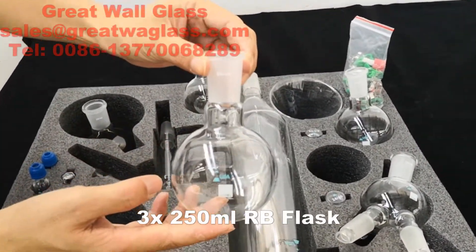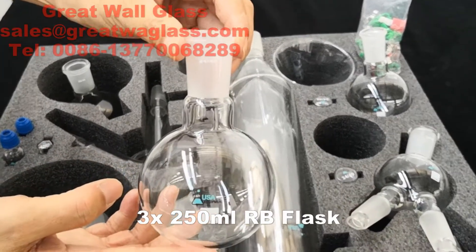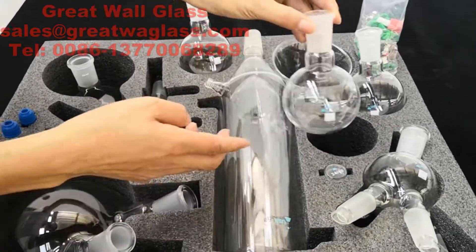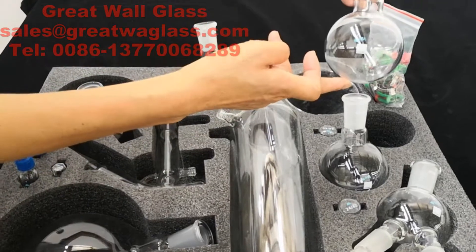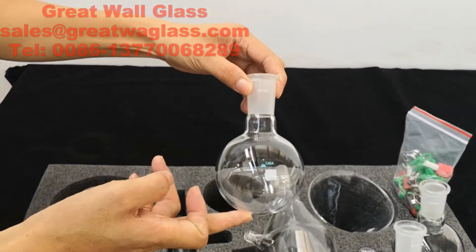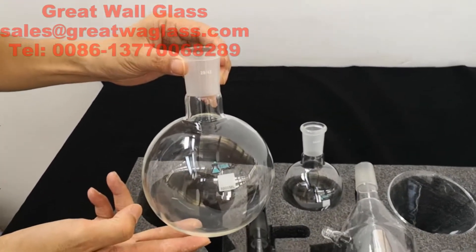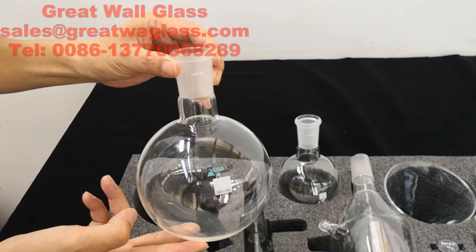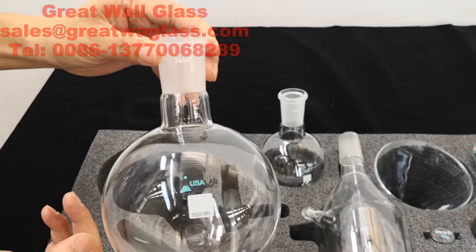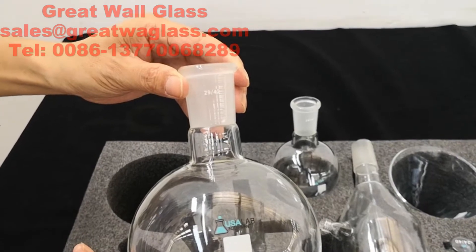Three pieces of 250-milliliter round flasks. One piece of one-liter receiving flask. Its joint is 29/42.